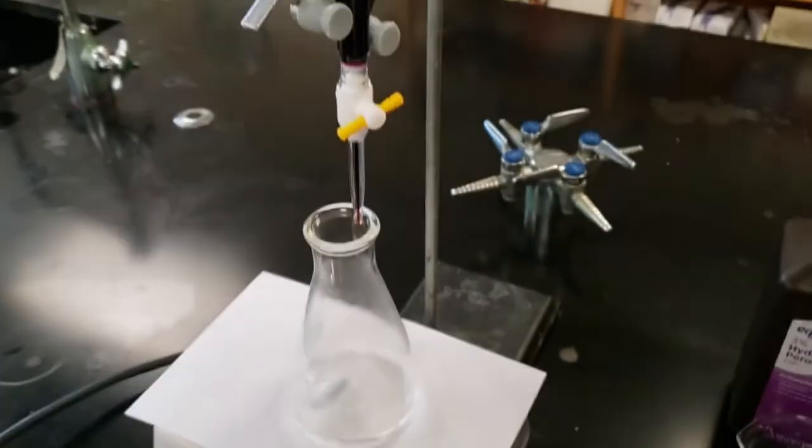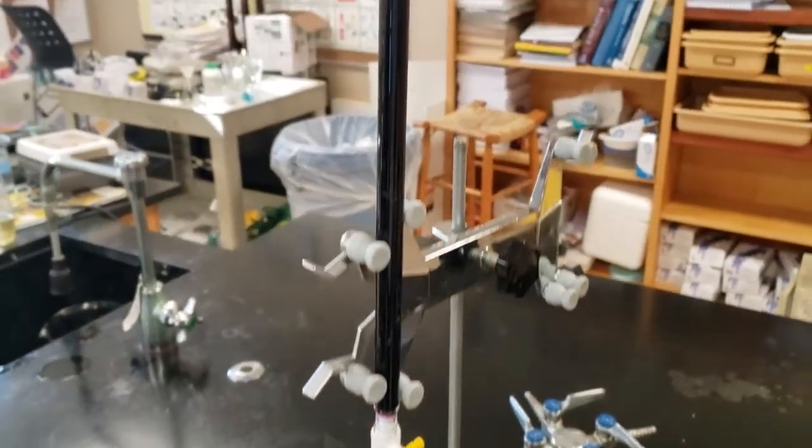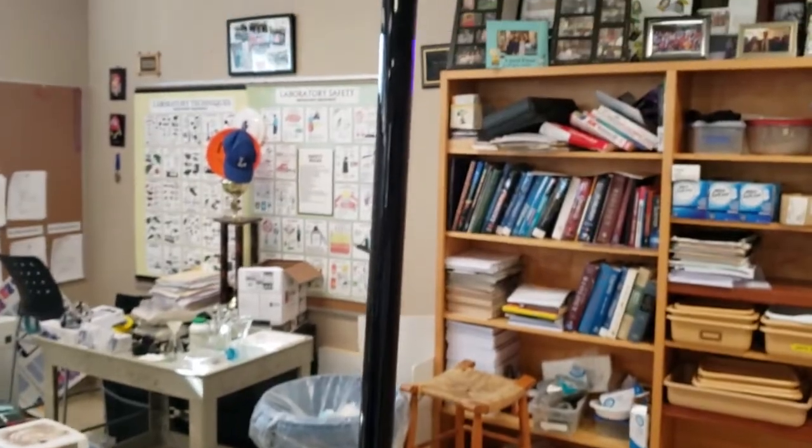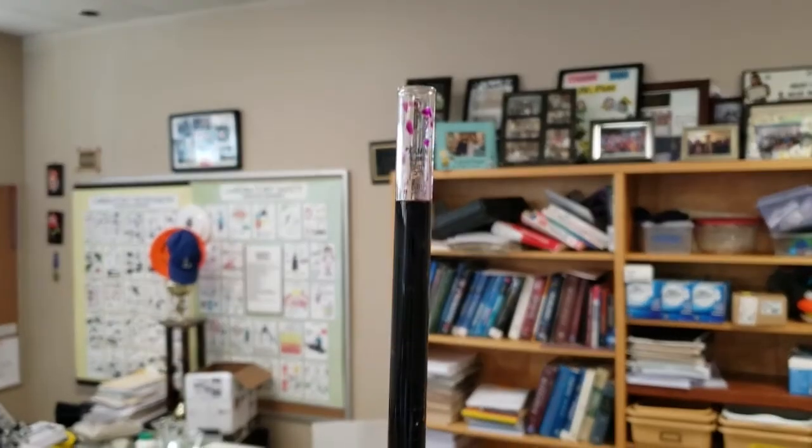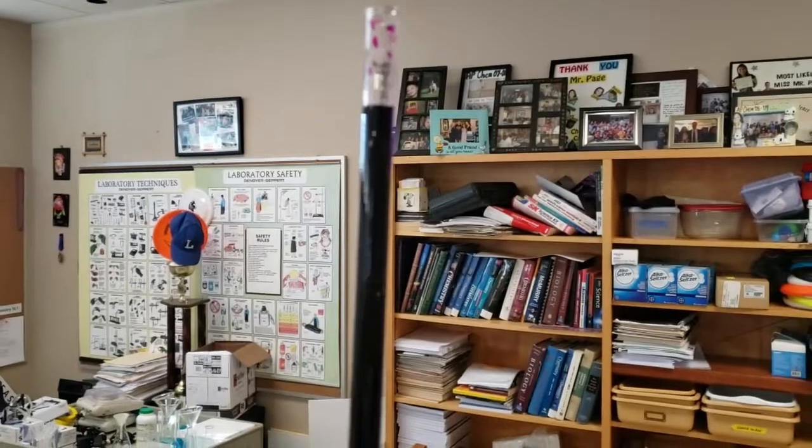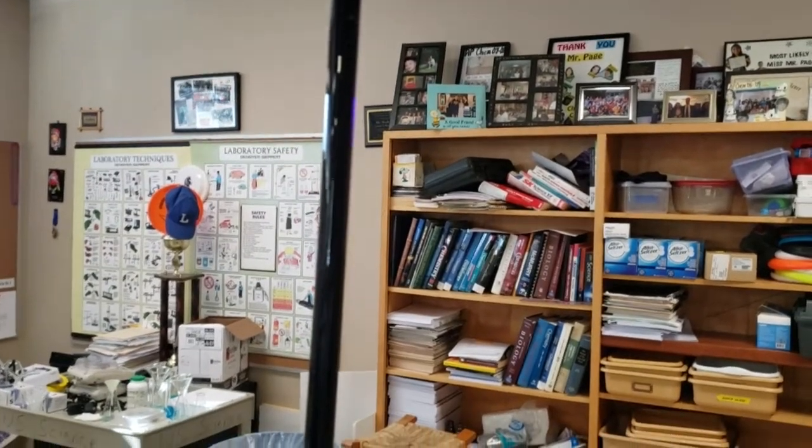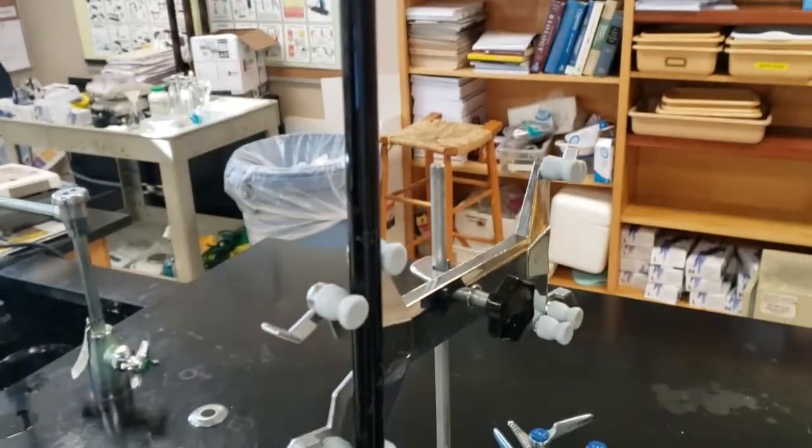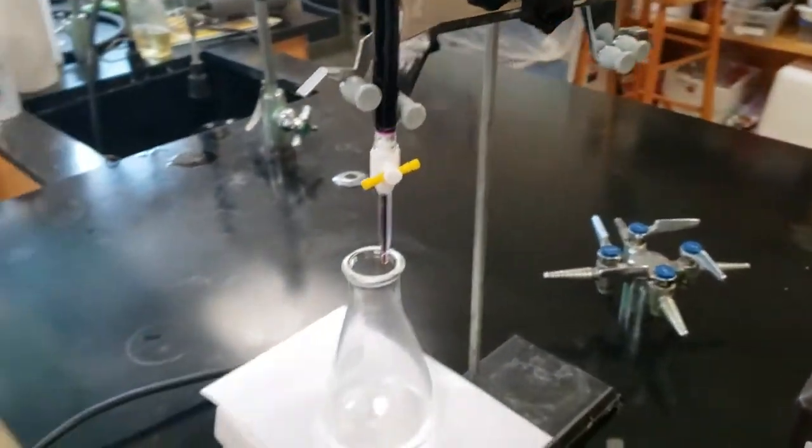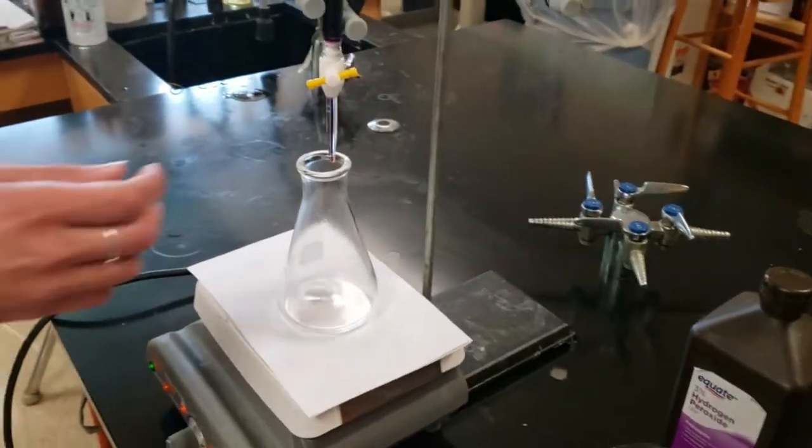In the burette, you have it filled and also burped, so all the air is out of it. And it's lowered down to right at the zero mark. The potassium permanganate is super dark, it's almost opaque. So in this case, we may want to read the top of the meniscus only because we can't see the bottom. As long as you're consistent, it won't matter.